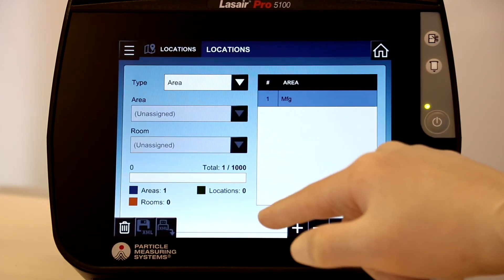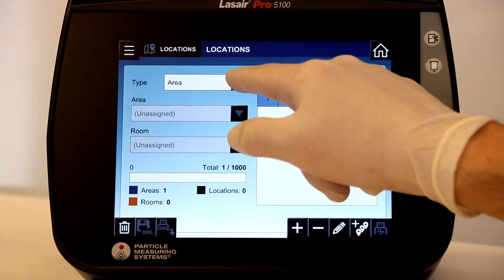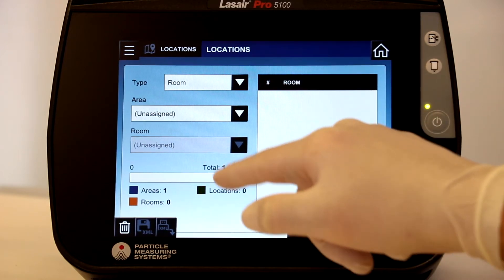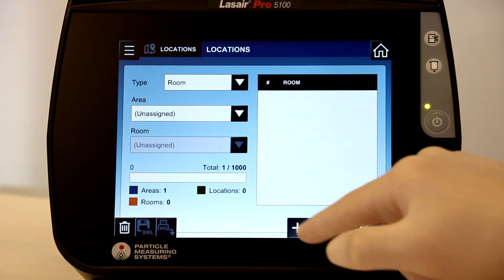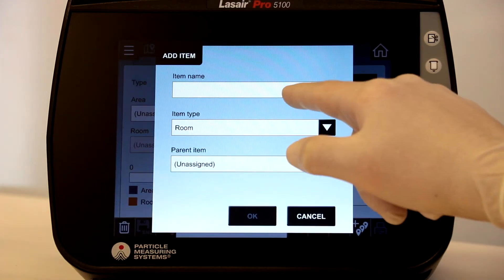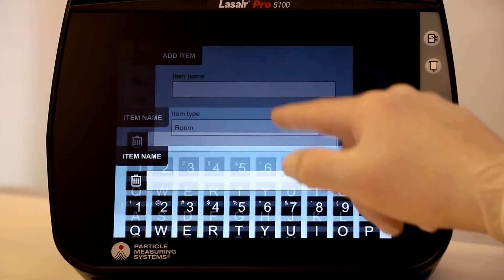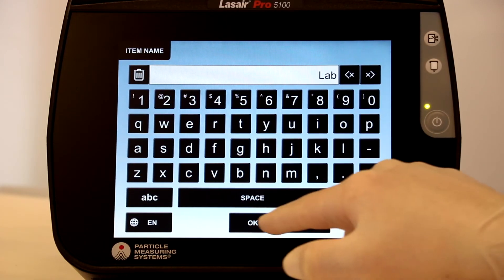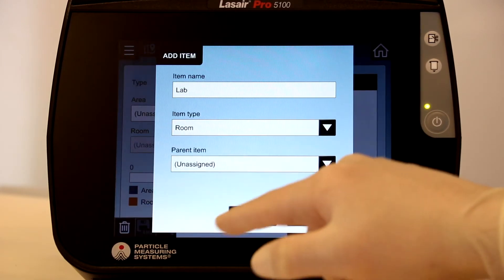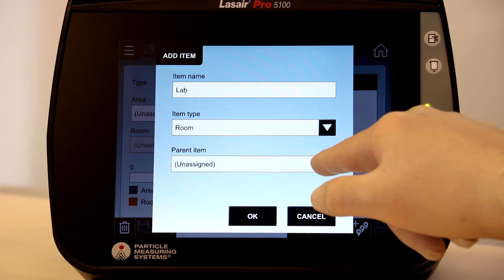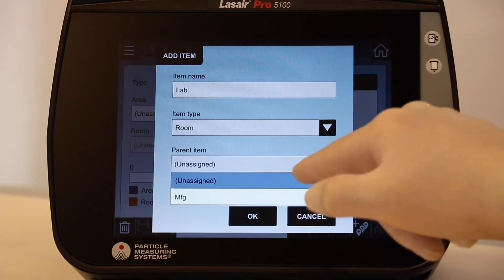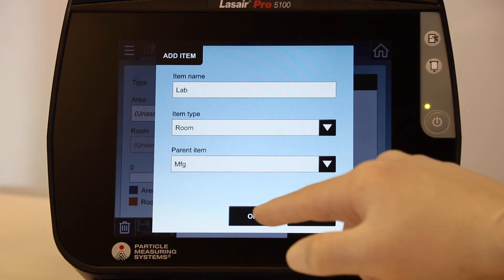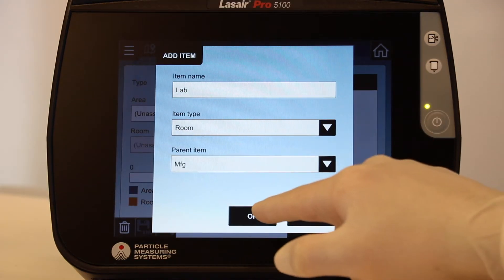Now we will add a room. Select Room in the Type drop-down. Select the Add button and the keyboard appears. Enter a name for the room and select OK. Here you can assign a parent location — in this case, we'll select the MFG area, then select OK.